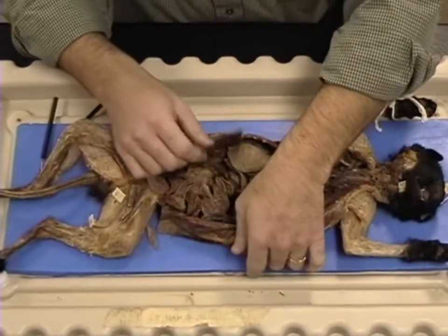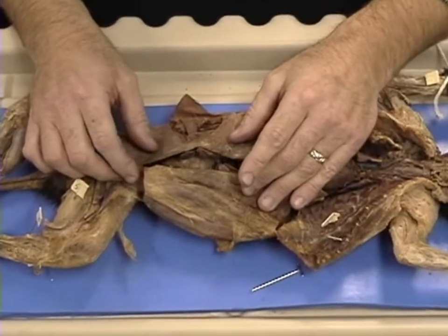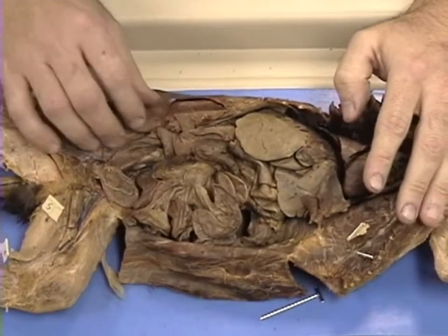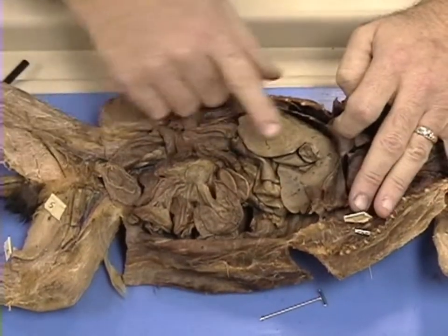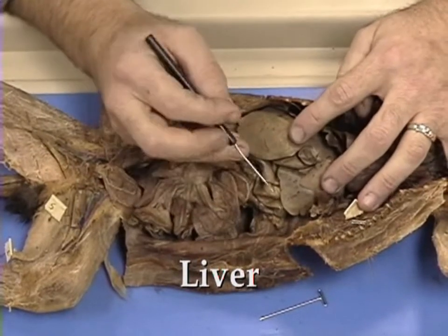Now, once we've opened up the cat, we've cut down through the rectus abdominis muscles of the cat, and we've peeled back the muscles to expose the abdominal cavity. Now, one of the largest organs in the abdominal cavity, and one of the easiest ones to locate, is first of all the liver. Now, the liver contains several lobes.